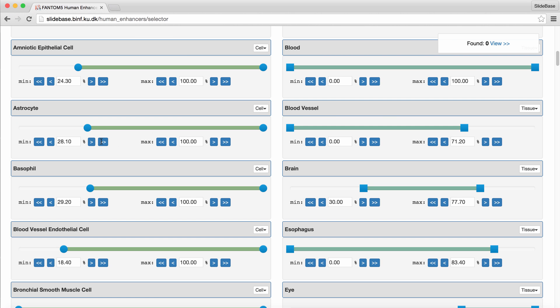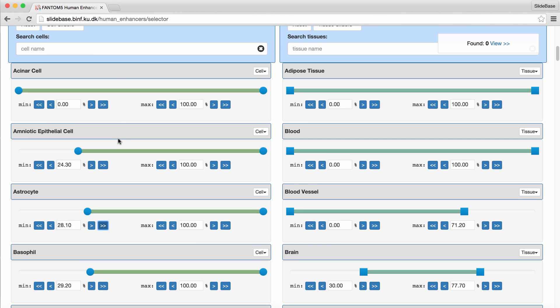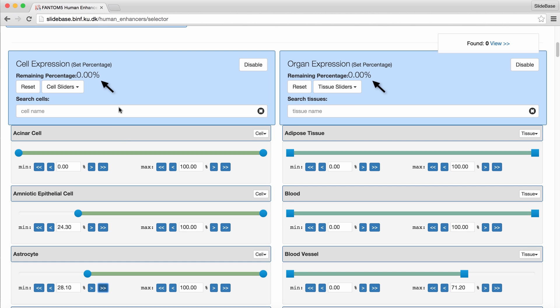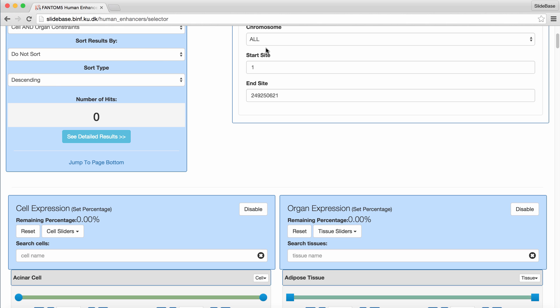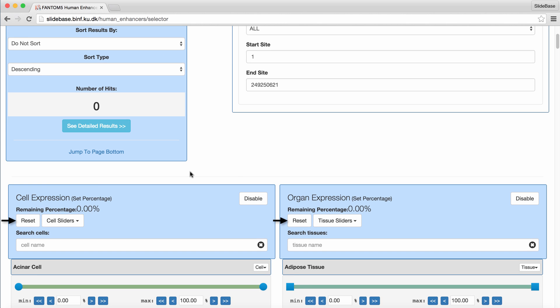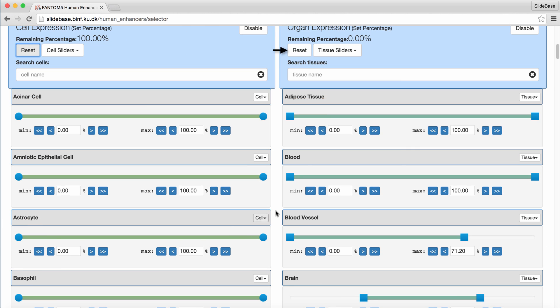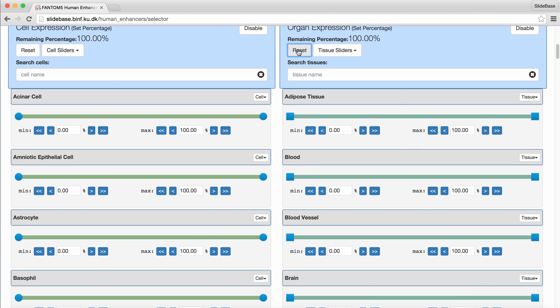In both panels we can set the sliders to at most 100% — one can observe the remaining percentage indicators. In this case, we have been too restrictive in our search and there are no enhancers that qualify. So let's reset our cells and organ sliders and show a use case scenario.